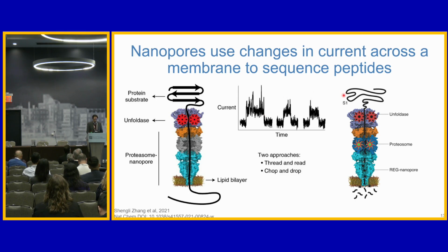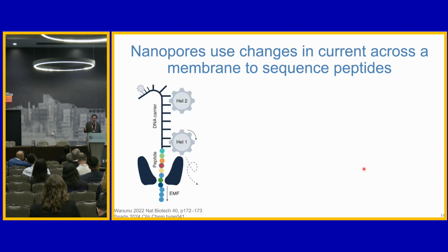Another way of treating this problem is to take a section of this giant pore and put a proteasome in it. One way you could pass through a particular protein is to digest it, with trypsin for example, and pass through peptides. Now you're trying to measure peptides instead of an entire protein, where the context of the amino acids in the peptide is a little bit more constrained. There are a couple of cool ideas centered around this approach. One of them is that you can start stacking this nanopore to be gigantic, right?